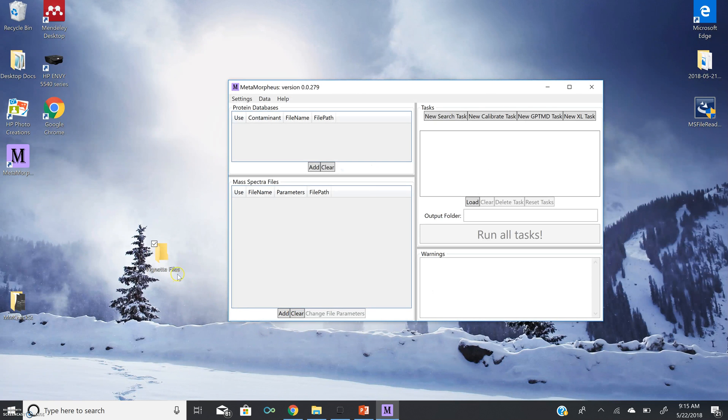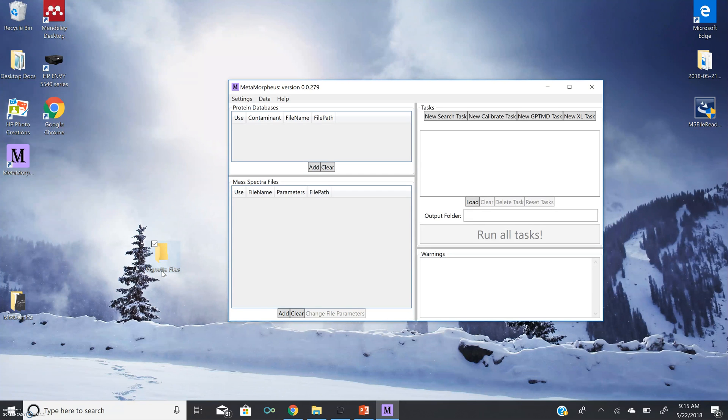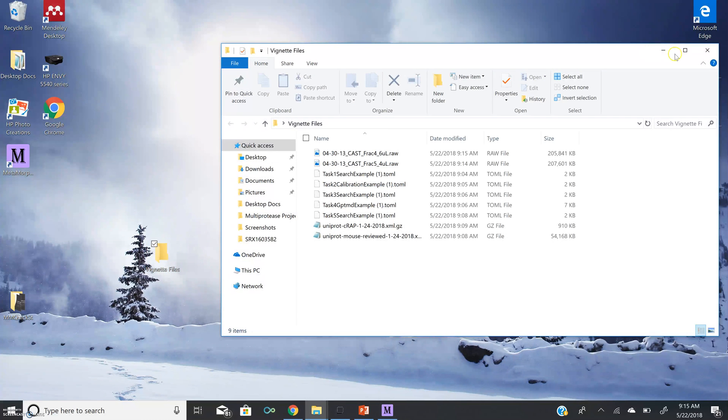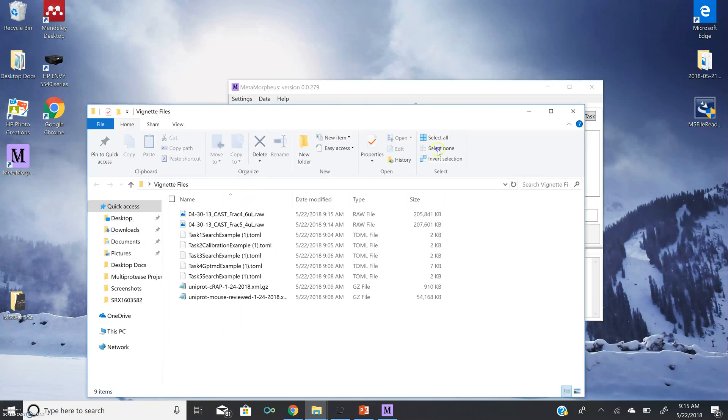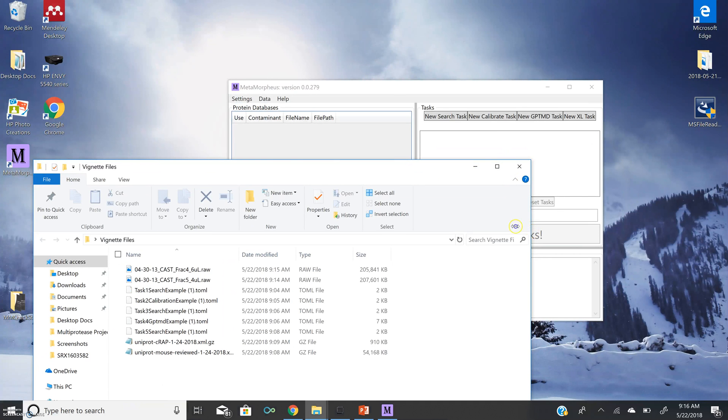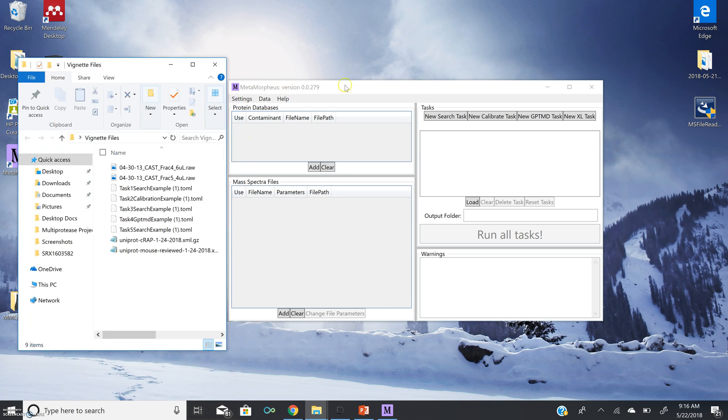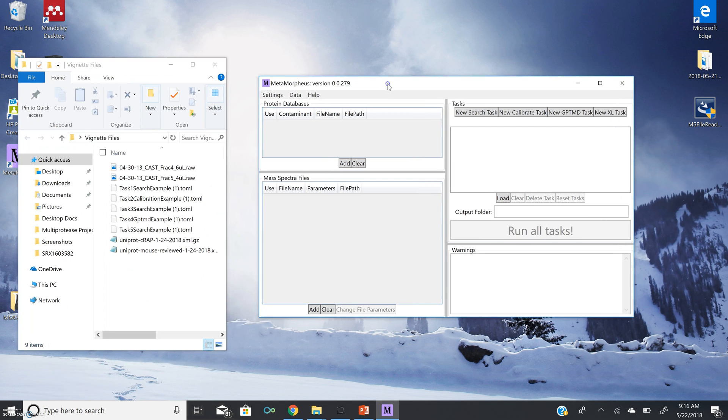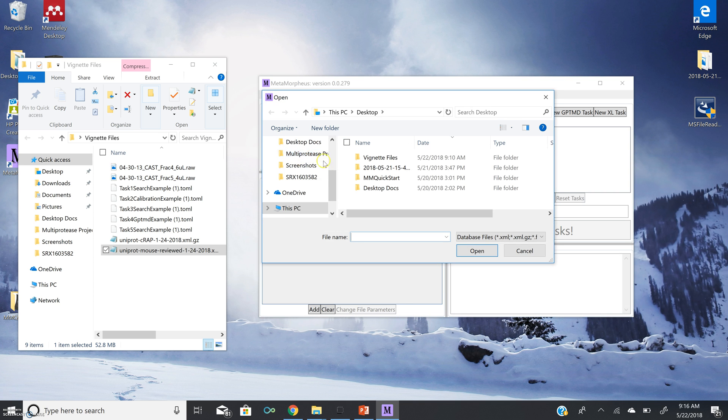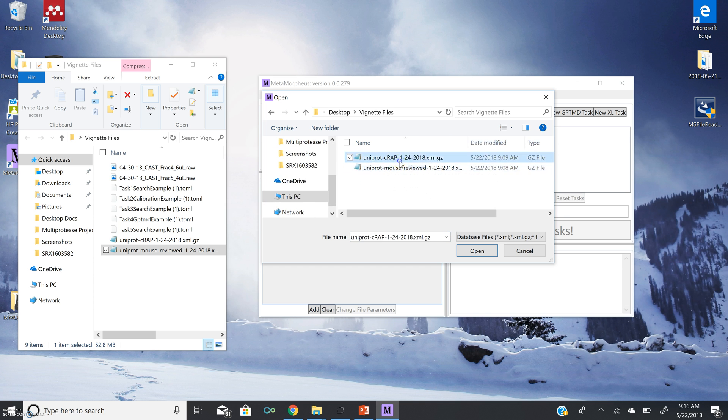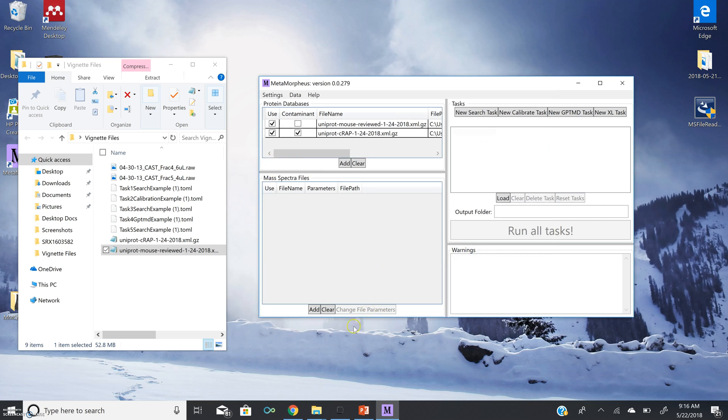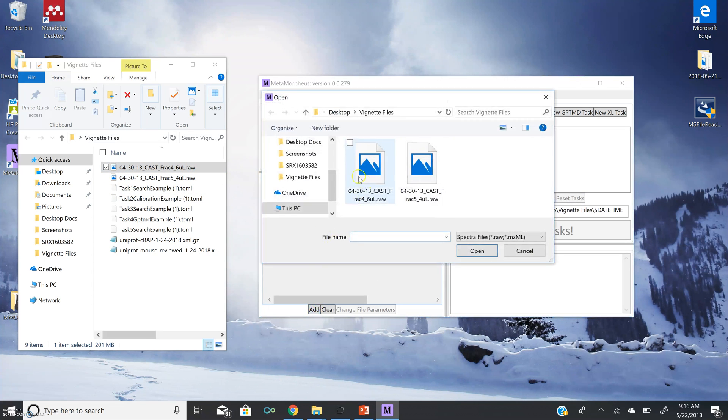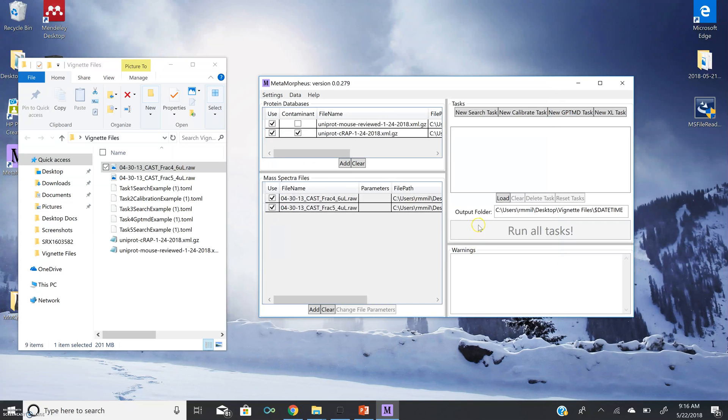Now, I have loaded all of the files we just downloaded into this folder on my desktop called Vignette Files. And now we are going to add our protein databases, our spectra files, and tasks to our Metamorpheus GUI. So first, we can open this file, make it a little bit smaller, bring it up alongside our GUI, and we can drag and drop databases into Metamorpheus, or we can add by browsing and opening them. You can do the same with spectra files. You can either drag and drop or add by browsing.